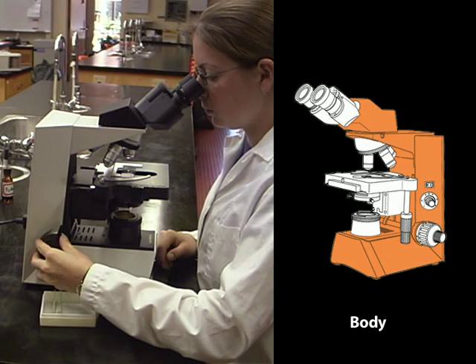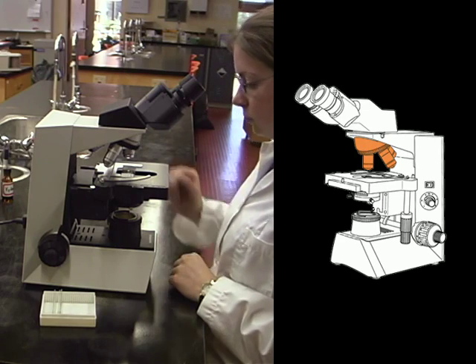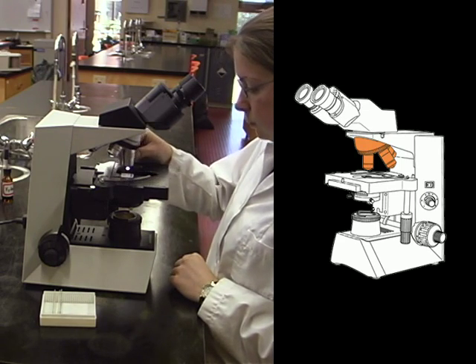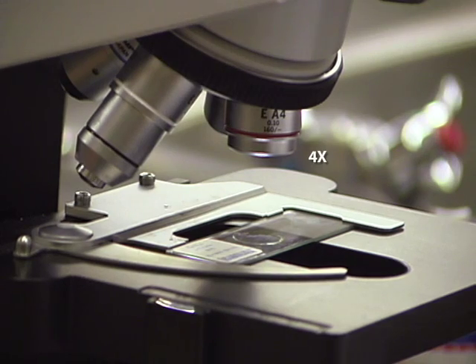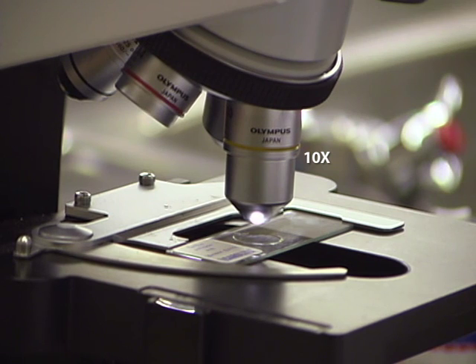The body of the microscope holds the lenses. Compound microscopes have two to five objective lenses mounted on a revolving nosepiece. Note that as the magnifications of the objective lenses increase, the physical lengths of the lenses increase.